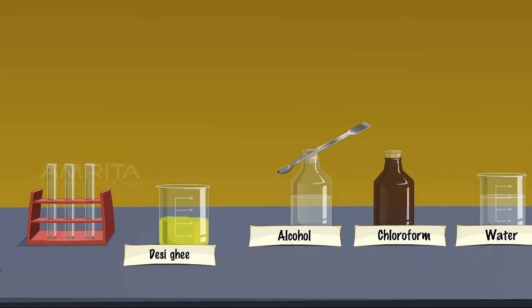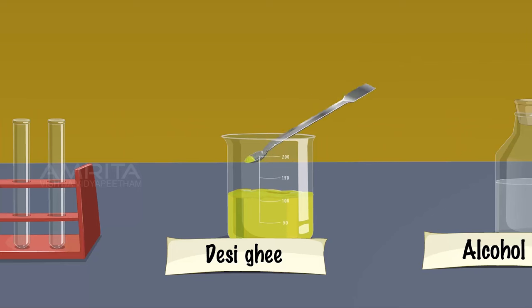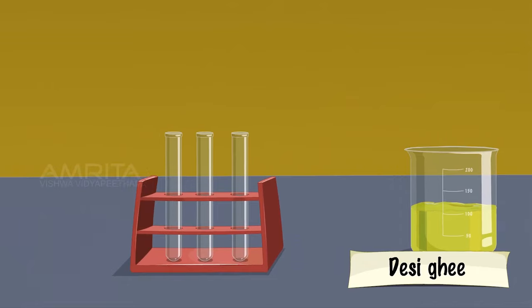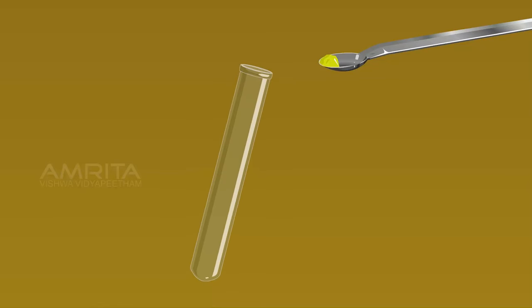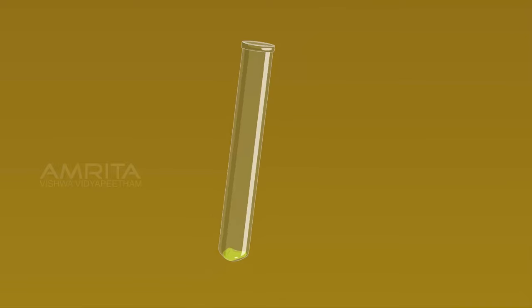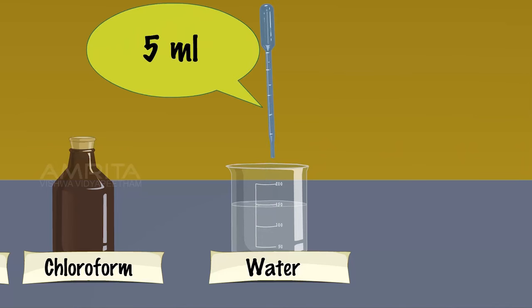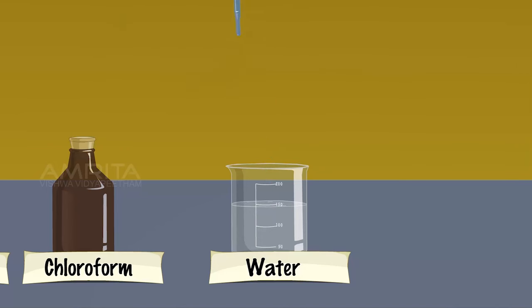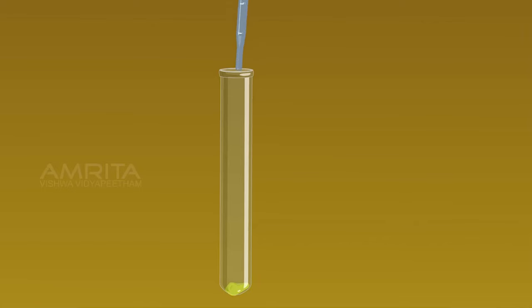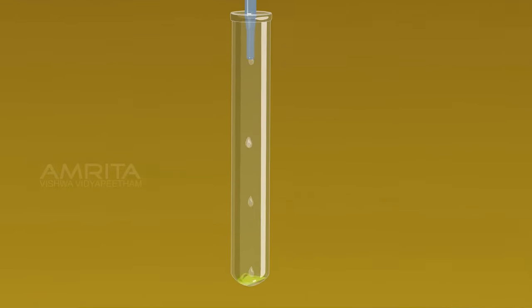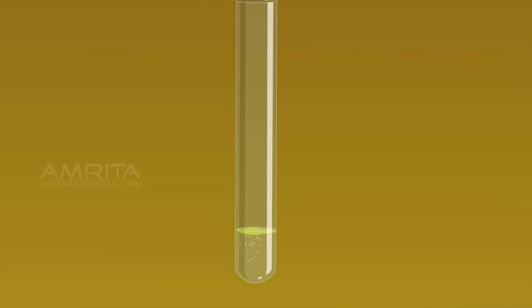Desi Ghee. Using a spatula, take a small amount of desi ghee in a test tube. Using a dropper, take about 5 ml of water and add it into the test tube containing desi ghee. Desi ghee is immiscible, i.e., not mixable in water.